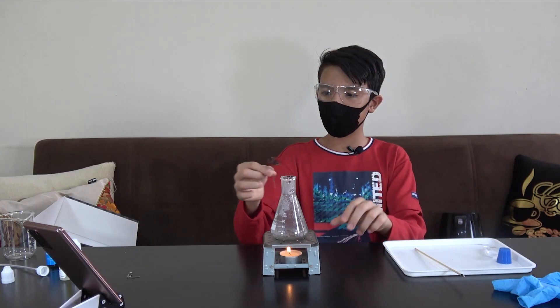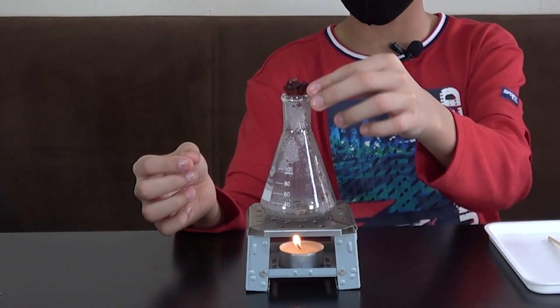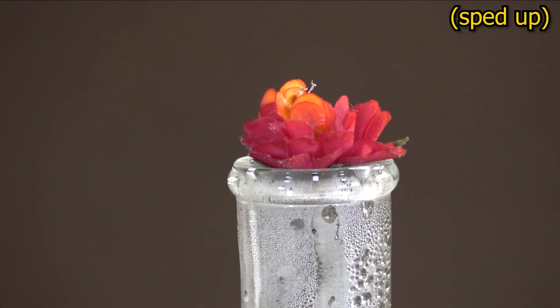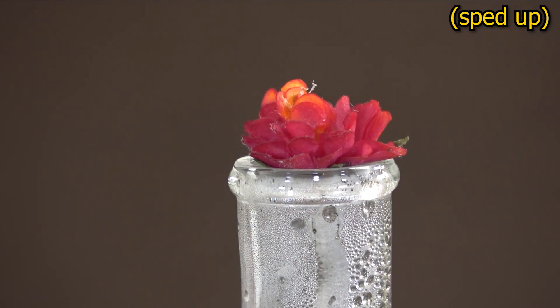A few moments later — okay, our three minutes is up. Now I will put the flower on top of this flask, just like that. As you've probably guessed, the obvious culprit in the case of your color-changing flower is the sulfur dioxide gas.